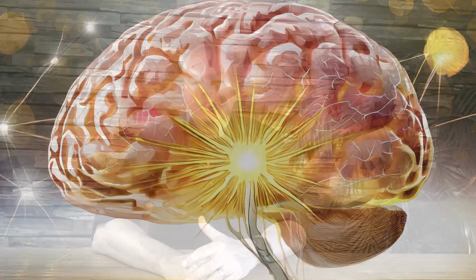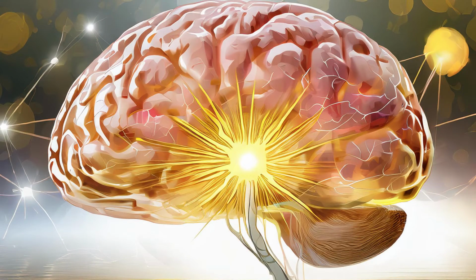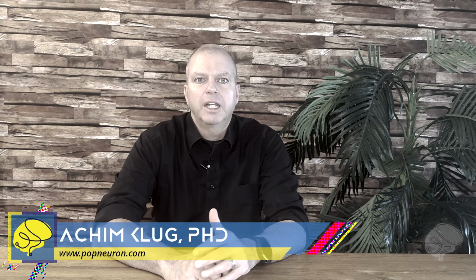Then that fiber can be connected to a light source outside the brain, which is either an LED or a laser. And then when the laser is turned on, the light goes through the glass fiber into the brain and shines into that brain area of interest and does its action there, which is either turning on neural activity or turning off neural activity. So that is optogenetics in a nutshell.